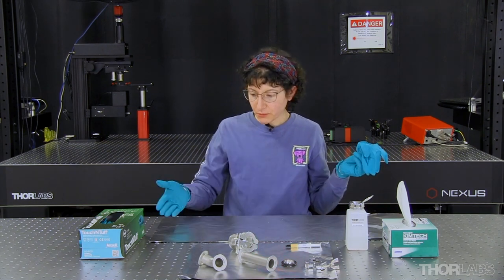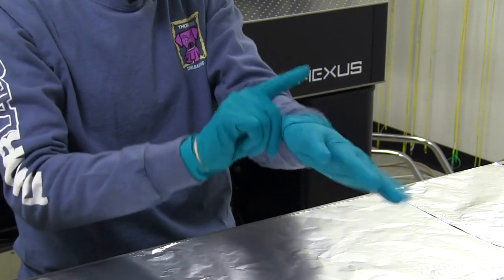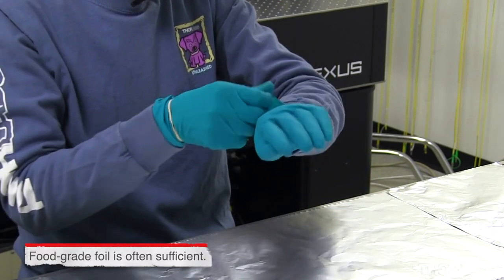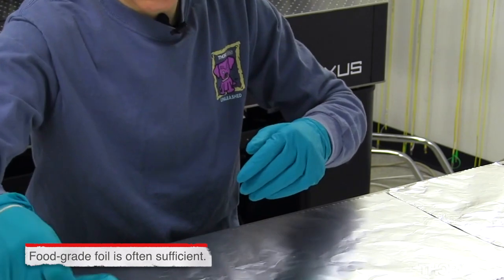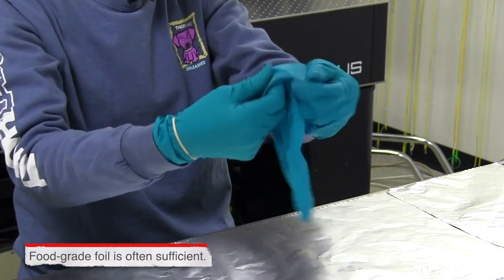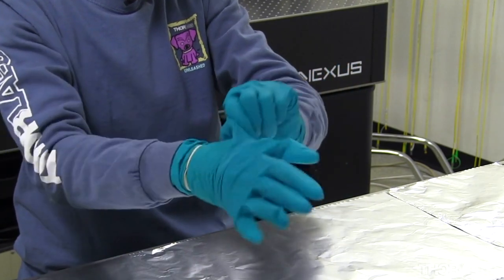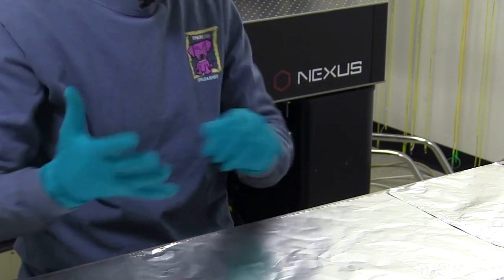I've already prepared my work surface, which mostly means spreading a piece of aluminum foil out. Aluminum foil is a fast way to create a work surface that's safe for vacuum components. Another benefit is that it can catch and contain any process material that might flake from the inside of components removed from your vacuum chamber.